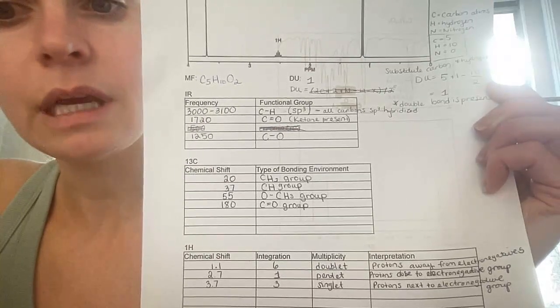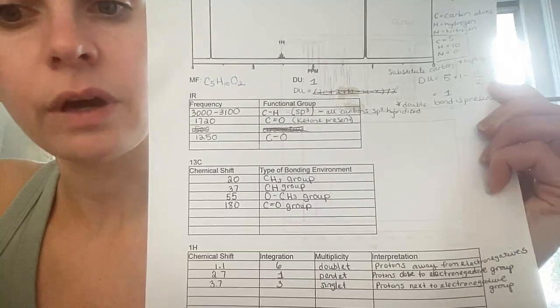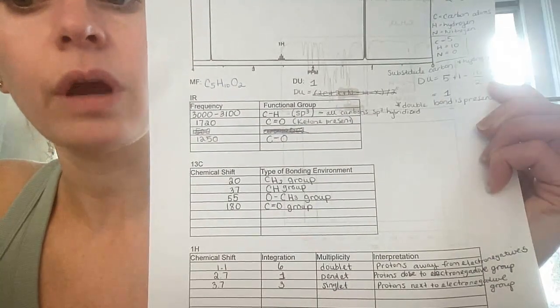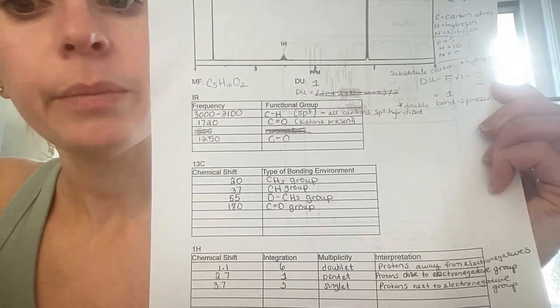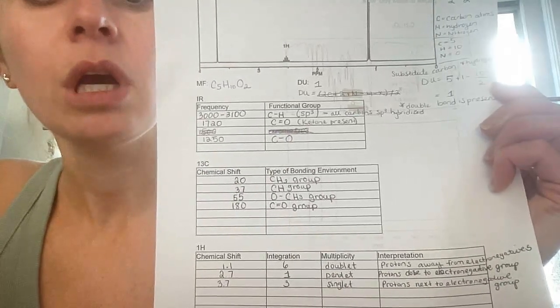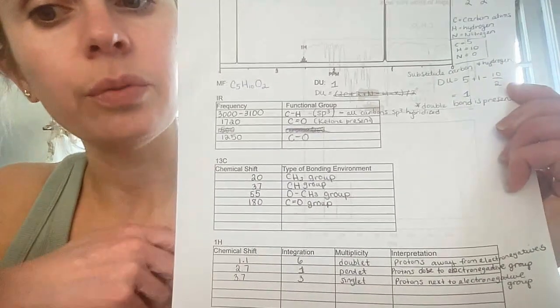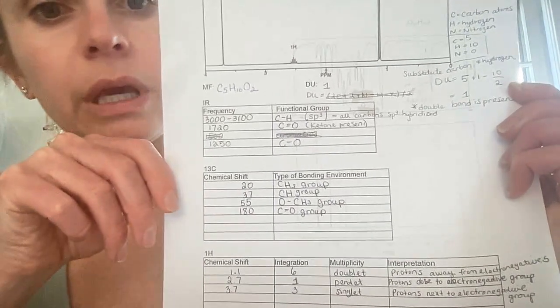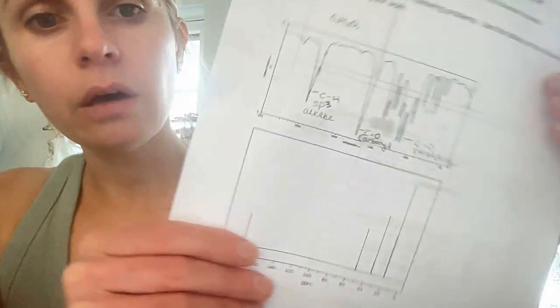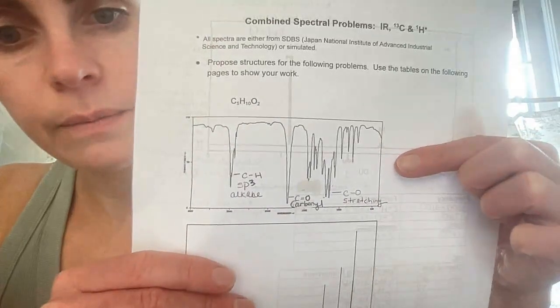Here we have an IR table demonstrating different peaks. This table correlates specific functional groups with their specific infrared absorption frequencies. By looking at an infrared spectroscopy absorption table, we can reference the first chart to figure out which functional groups go with each frequency and peak. So we're going to turn this around and reference this chart right here.